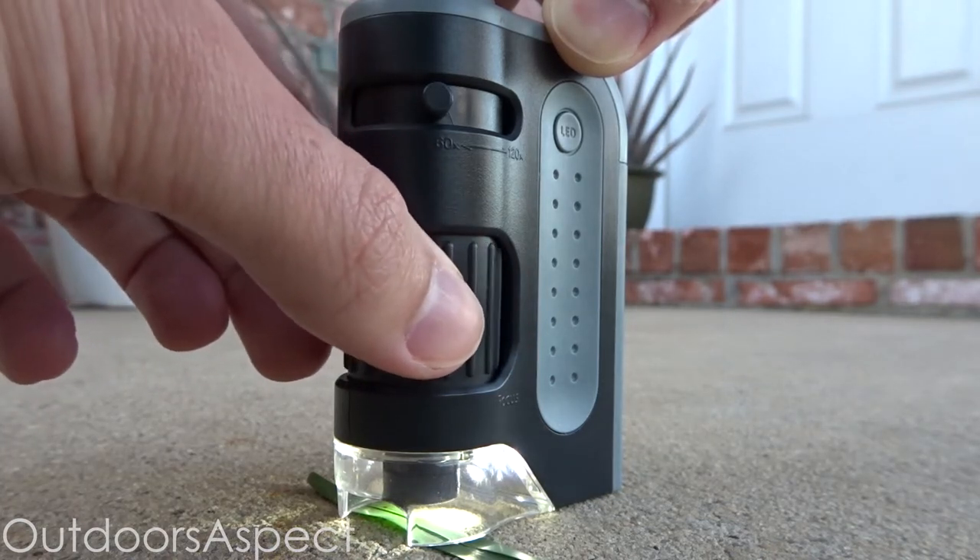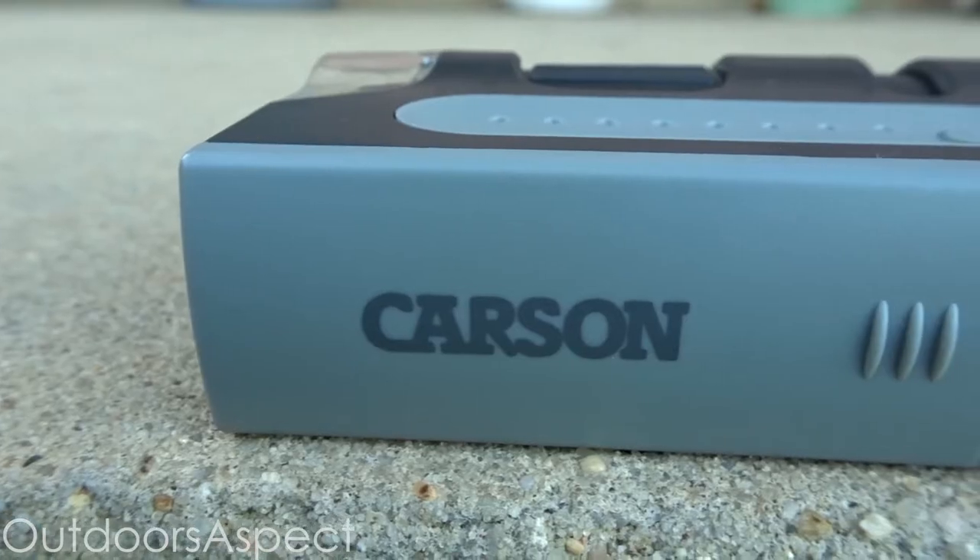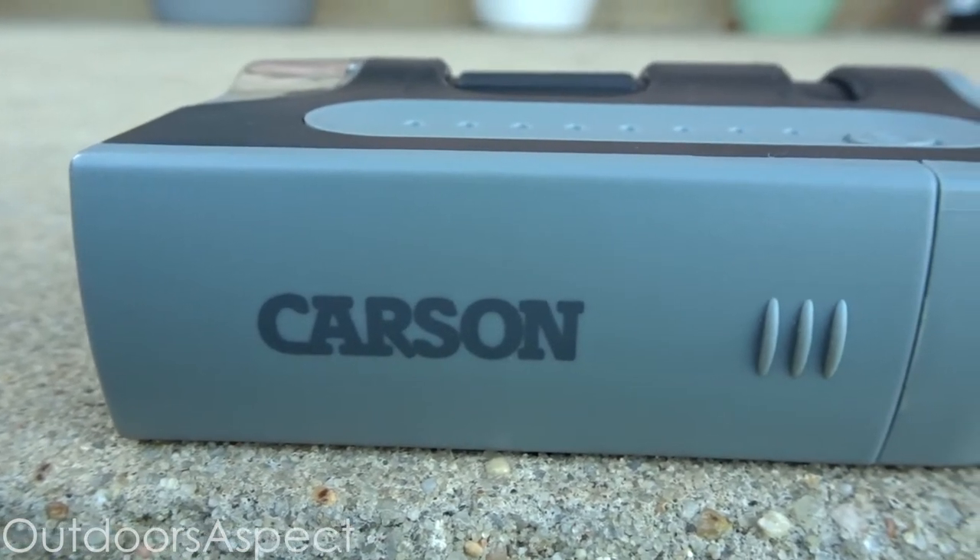Remember, if you choose to increase the magnification you'll need to use the adjustment wheel to re-focus on your specimen. Here are a few photos of what you can actually see with this microscope.